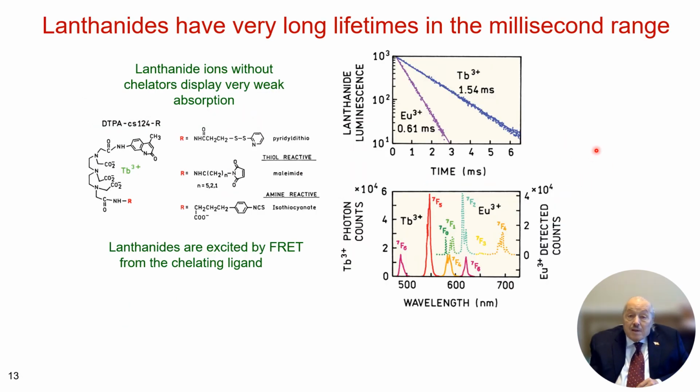Okay, on to yet another type of probe. These are lanthanides. And the lanthanides are quite interesting. They have extremely long lifetimes.